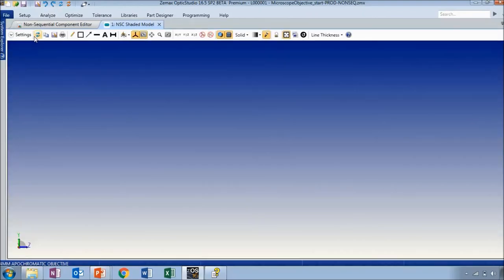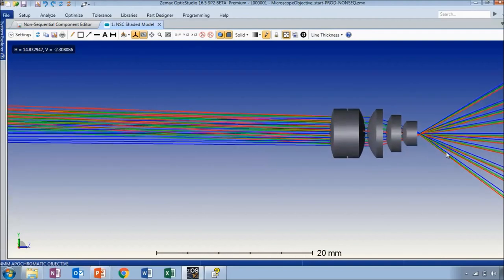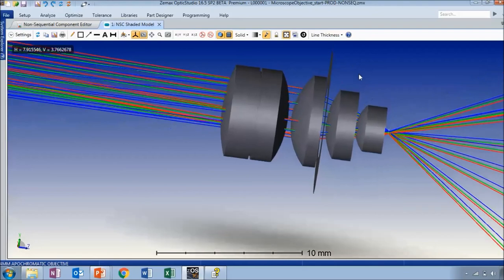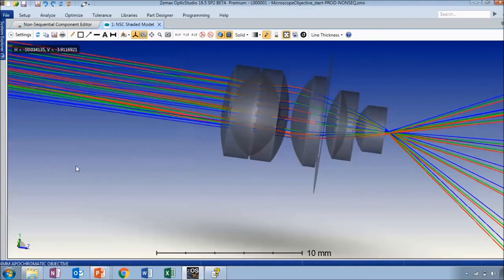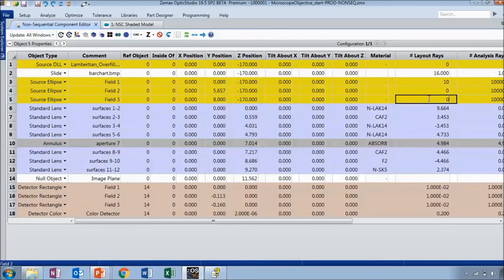Similar to the idea behind the Lambertian Overfill and bar chart objects, we also have a larger area color detector covering the full area of the image plane. Opening a shaded model view, the system looks almost exactly the same as it did in sequential mode. Note that the full field source automatically has its rays turned off — you'll have to manually turn them on. The detectors are not set to be absorbing, so we can see rays traced all the way through them. Let's set 50% opacity so we can see the lenses within the system.